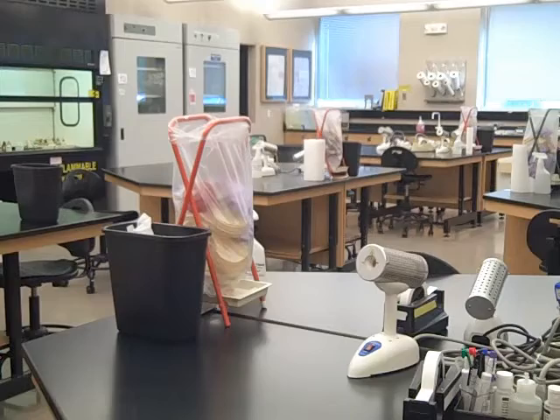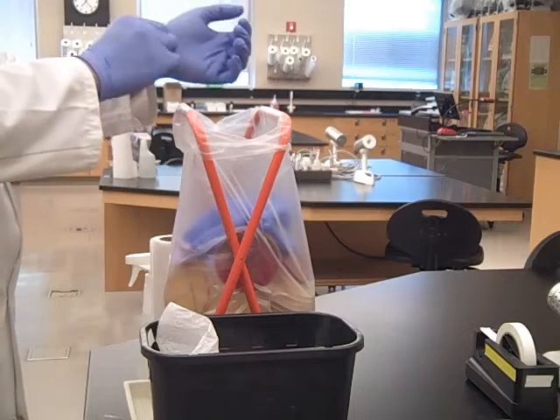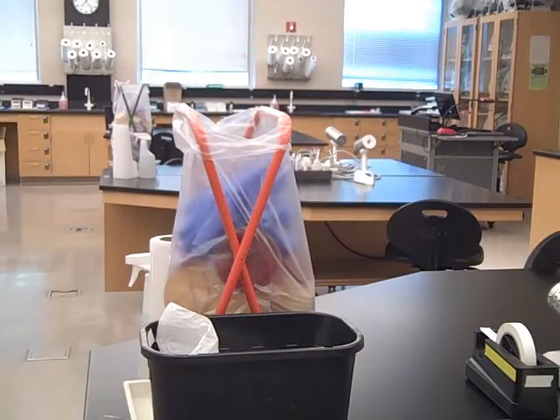Used petri plates are disposed of in the autoclave trash. When we remove gloves in the microbiology lab, we remove them by turning them inside out and disposing of them in the autoclave trash.